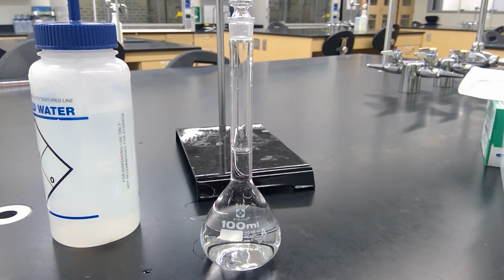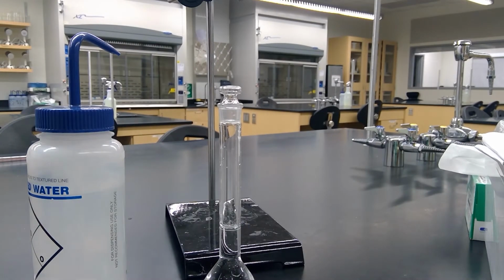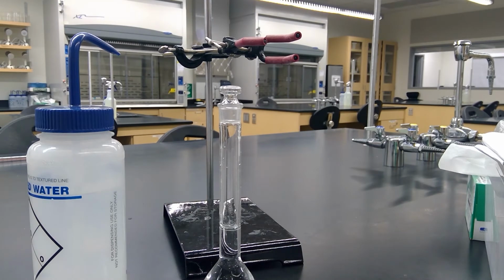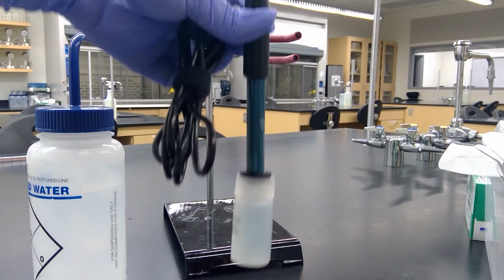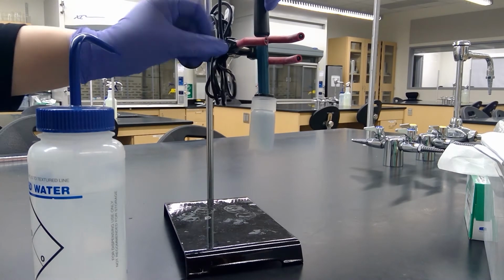Let's see if you can see the clamp. Alright, so you'll want to grab a pH probe, which looks like this, and we're just going to attach it.